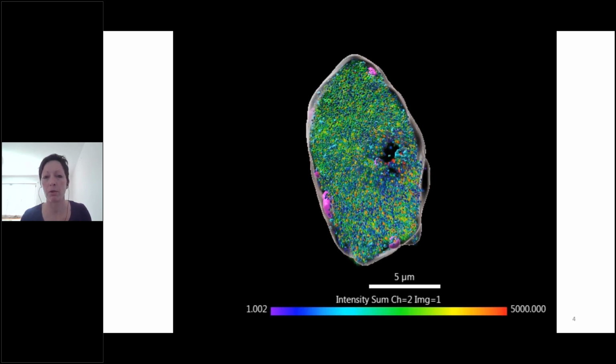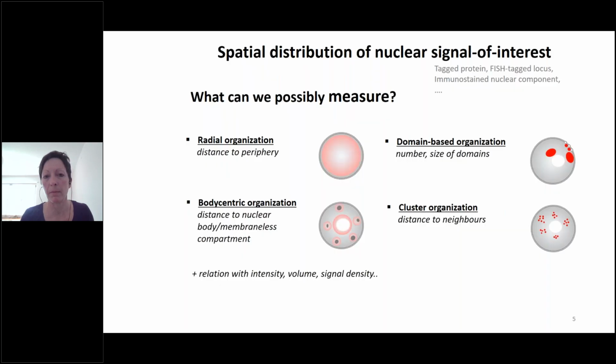So now I've just shown you a little animation, which is more of a teaser, but I will go through the technicality now with you in a few slides.